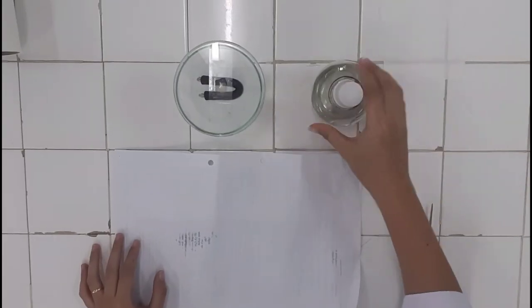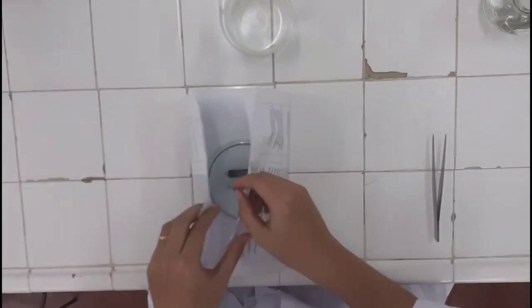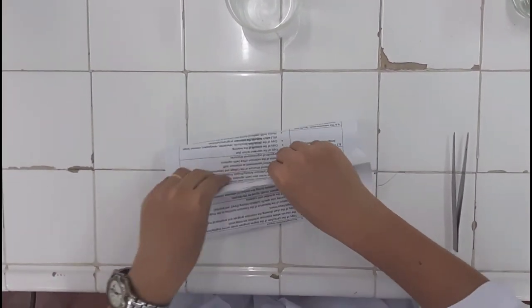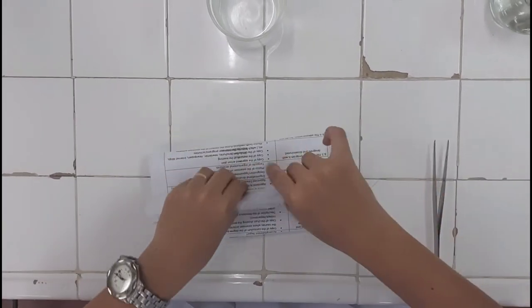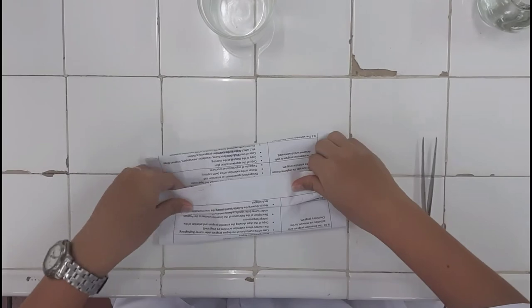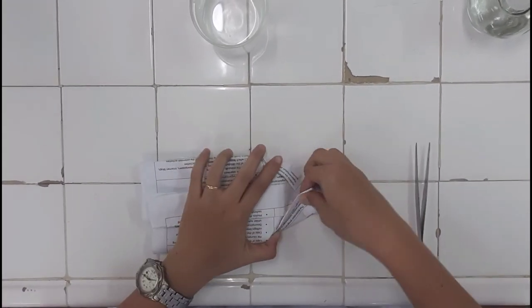Cover the petri dish and avoid inverting the plates because the other block might fall to the base. If it falls, it is already an error. Any paper can be used as long as it is sterilized to avoid contamination of the agar block.